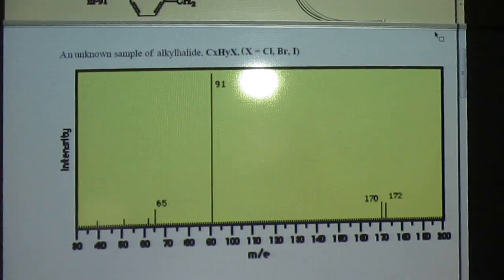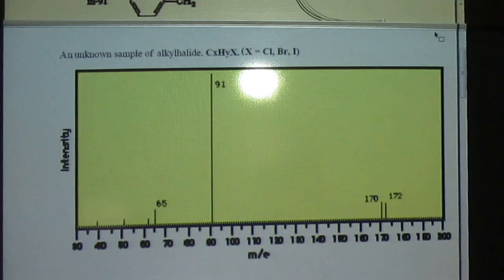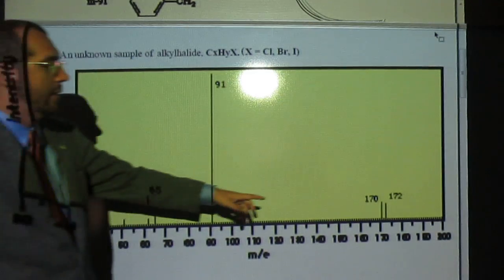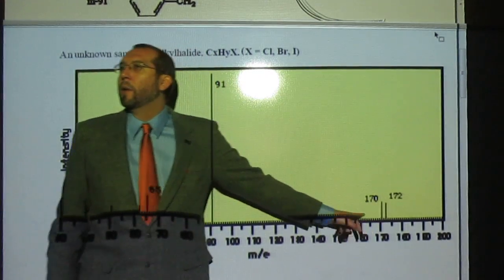When we look at this mass spectrum, how do we identify which halogen we have in the spectrum, or in the molecule? Well, we have to look at the parent ion. When we look at the parent ion here, and we see the ratio of them is what?